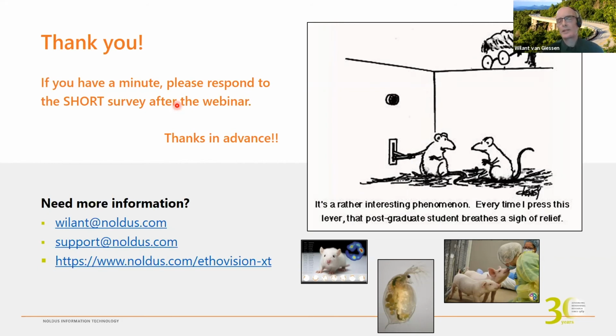Now, there's nothing wrong with copying, because the backup is basically making a zip file of that same folder. There's nothing magical about it. It's a zip file of everything. If people do it that way and it serves them well, then I'm not going to argue. It's just a convenient way of moving your data around and for safekeeping and moving it to other computers.